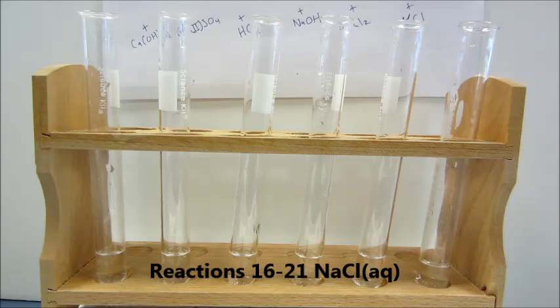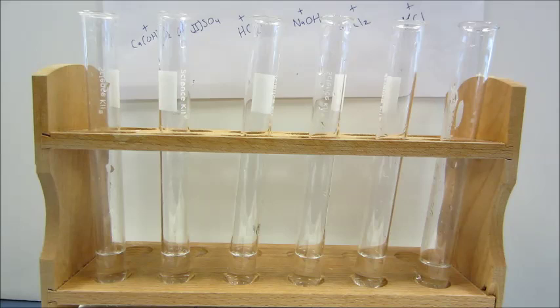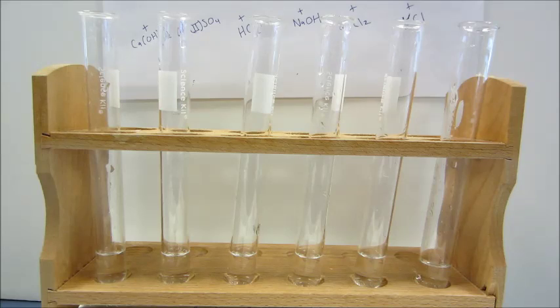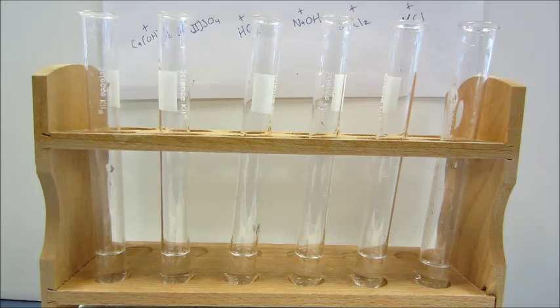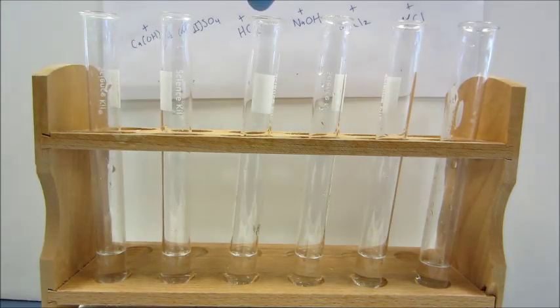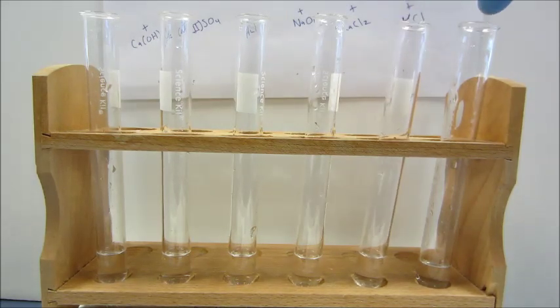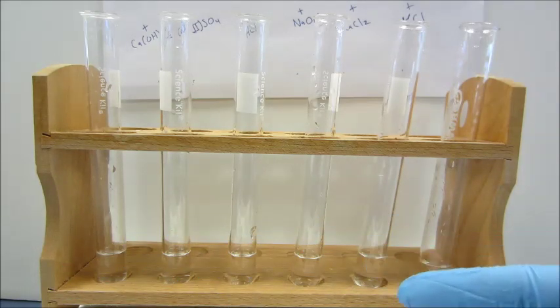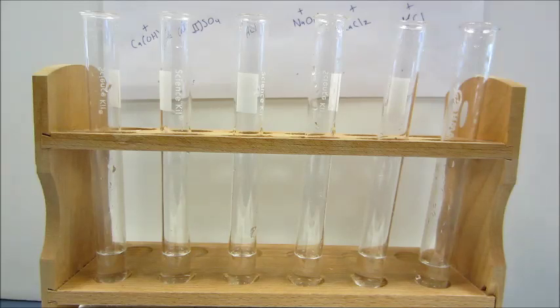As you can see, we've got our salt water — about two to three milliliters in each of these six test tubes. Going along with our reaction series, we're going to add a second reactant to each test tube to check for a double displacement reaction. We've got calcium hydroxide, copper sulfate, hydrochloric acid, sodium hydroxide, calcium chloride, and potassium chloride. Those are the six things we're going to add to these test tubes, which all just contain sodium chloride. Let's begin.